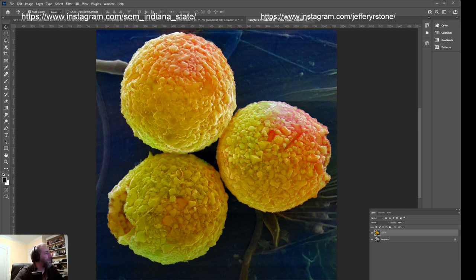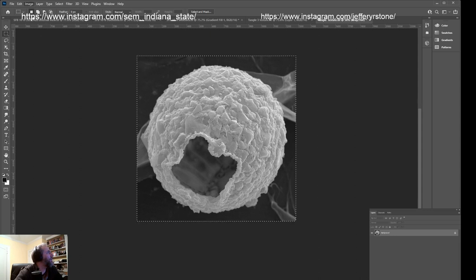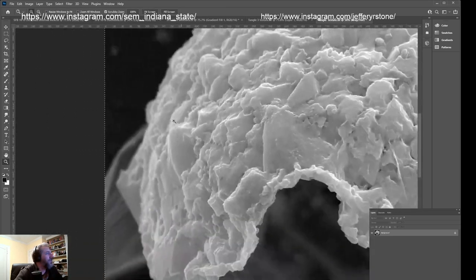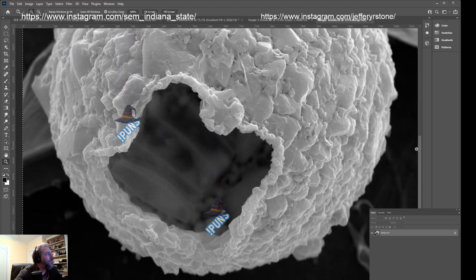There's one set of three testate amoeba that we saw on the scanning electron microscope together, and then somewhere I have another picture of one. You can look right into the inside of this one. There's a testate amoeba where you can see down into the middle of it. Oh, we got too close. We're looking right inside of the testate amoeba's skeleton. This is where parts of the little pseudopod would stick out here.